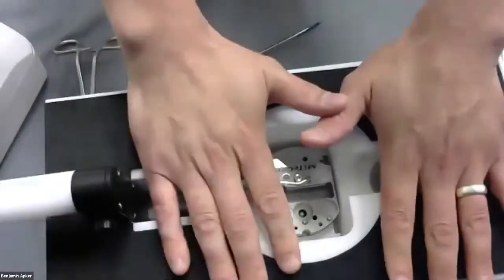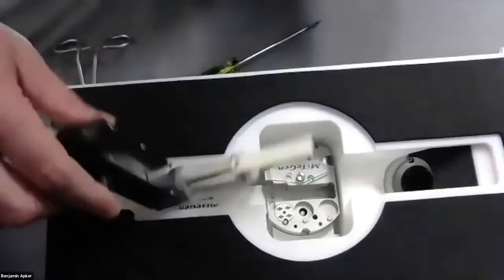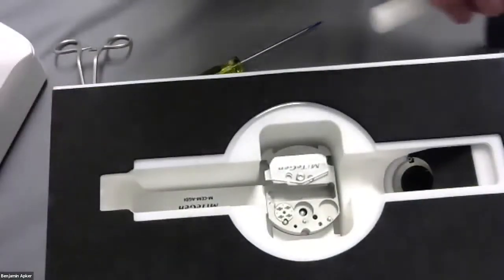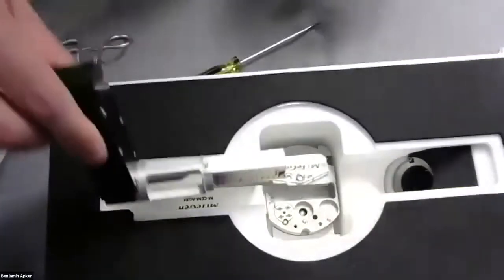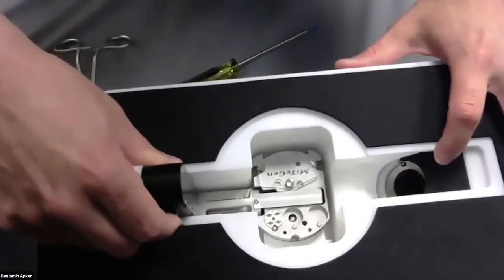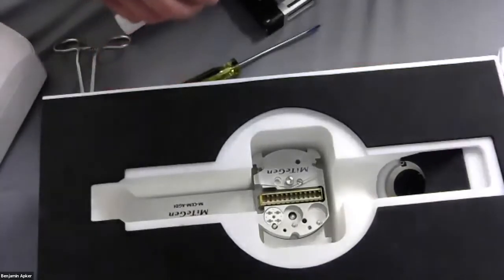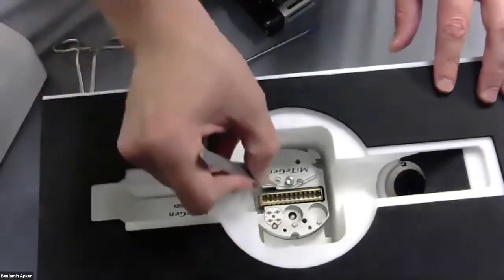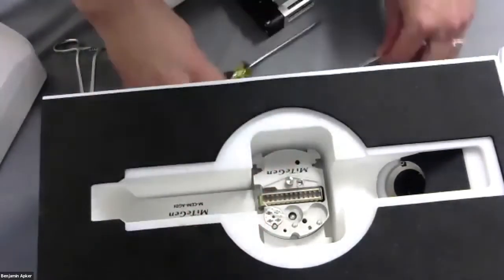This is an autogrid cassette loading station. Typically it comes with a particular insert that holds the cassette and the grid boxes as shown in the autogrid inspection image. Using the standard tools, you can transfer in an autogrid cassette, then transfer clipped grids from your cryo grid boxes into the cassette. This lid then rotates just like the puck.